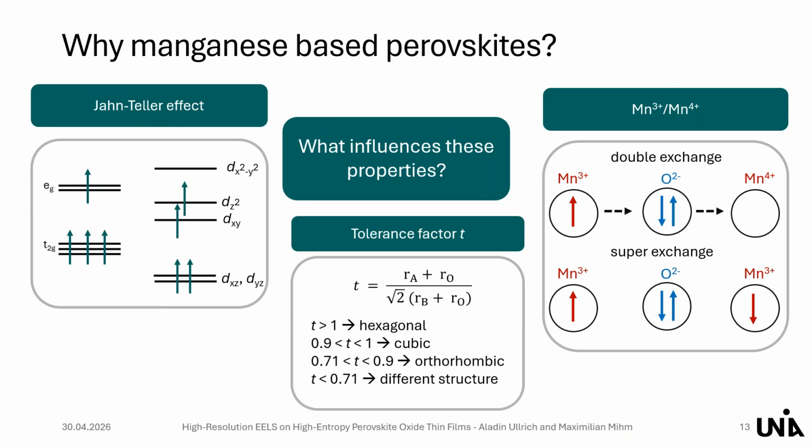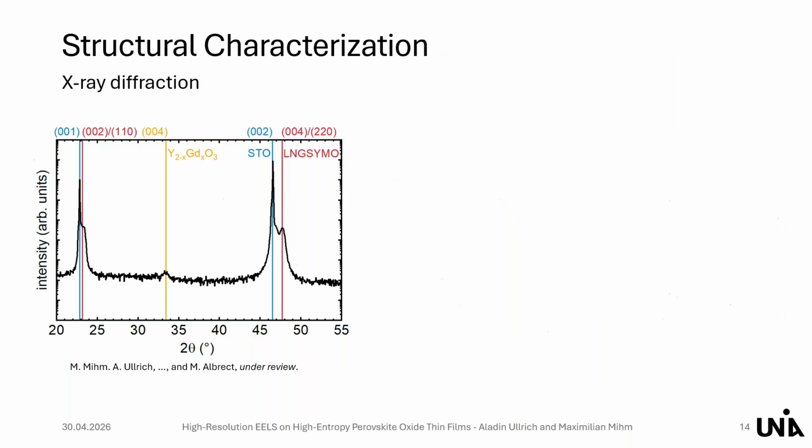So let's come to some results. Here you can see our XRD pattern obtained from the prepared thin film. Blue is our STO substrate. In yellow, it's an additional phase which we obtained. And in red, you can see our thin film. Here I wrote down the 002 and 110 orientation of the orthorhombic thin film, because these are theoretically less than 1 degree apart. And just from this XRD graph, it's hard to say which orientation we have.